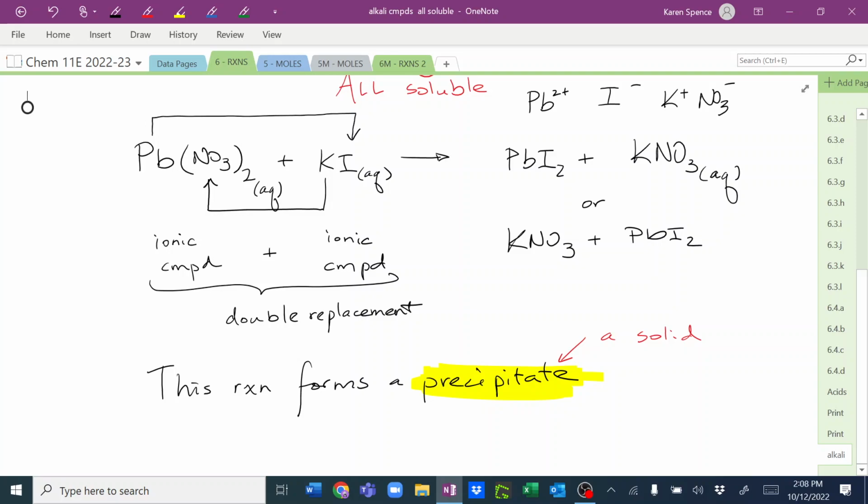Okay. So if you have that, it goes into spin cycle and it spins around. And if you have an unbalanced load, your washing machine will literally start walking across the room. Similar problem here, right? Because I hadn't balanced it. I was all distracted and whatnot. And anyway, so now it's balanced. Now it shouldn't judder around and things like that. So I'm going to close it. I'm going to turn it on.